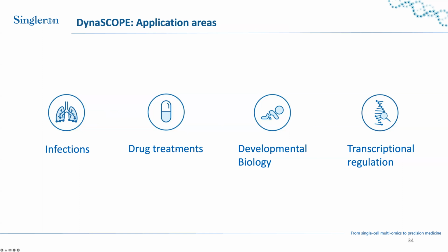So you can really look into primary and secondary effects of the treatment on the transcription regulation. And you can also identify potential new druggable target genes.